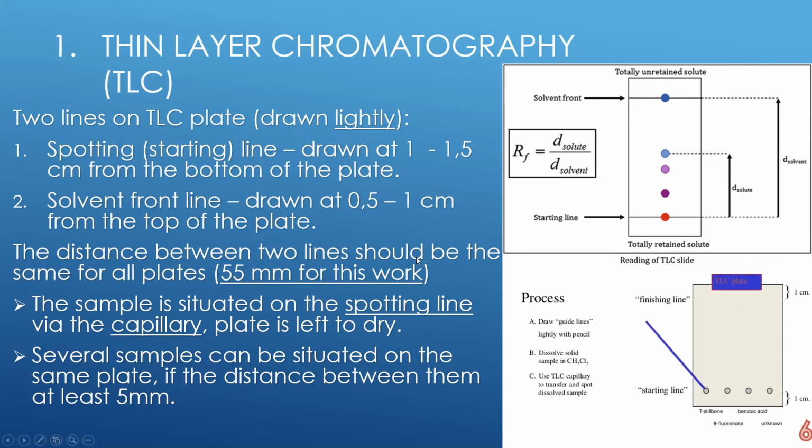The distance between the two lines could vary, but it is better if it is the same. For this work, as we will see in the video, it is drawn at the same distance, 55 millimeters. So from the start line to the finishing line, the front of the solvent should travel.